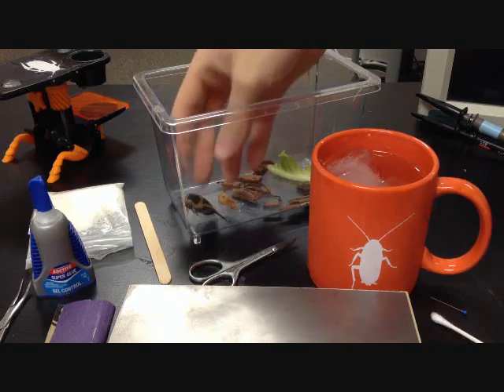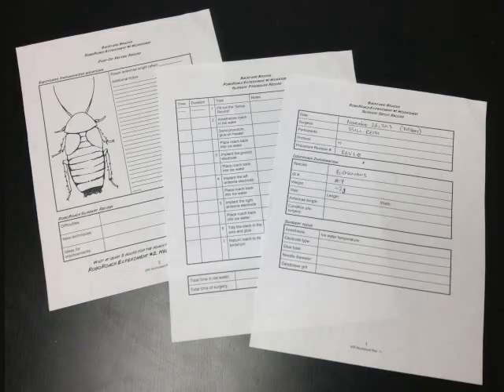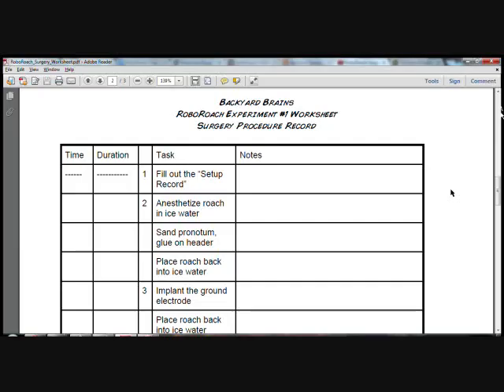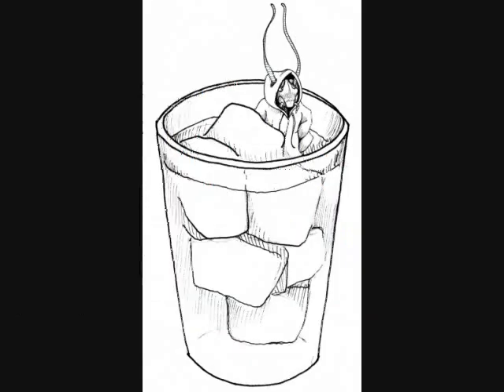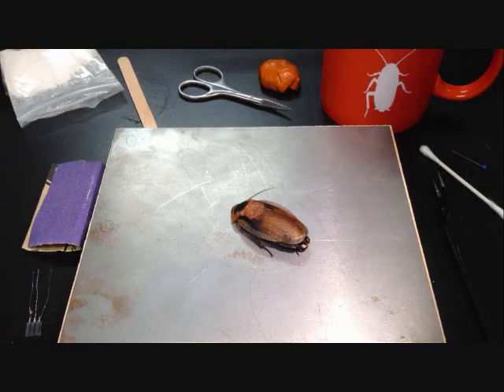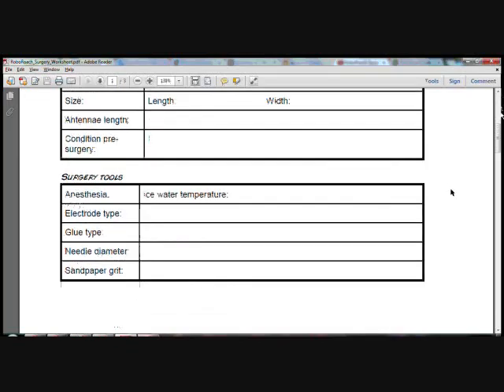Now it's time for the biology. Begin anesthetizing your cockroach by carefully submerging it in the ice water. Note your start time on the procedure record, page 2 of the surgery worksheet, and continue to record the time at each step and add notes as you progress. Since the roach is a cold-blooded animal, reduction in temperature results in reduction of nervous and metabolic function, effectively anesthetizing the insect. It typically takes 2–5 minutes for a cockroach to go to sleep — watch for the roach to stop moving and reacting to stimuli, such as a light touch. Once fully anesthetized, carefully remove the roach from the ice water with forceps and record the weight and size measurements of your cockroach on page 1 of the surgery worksheet.